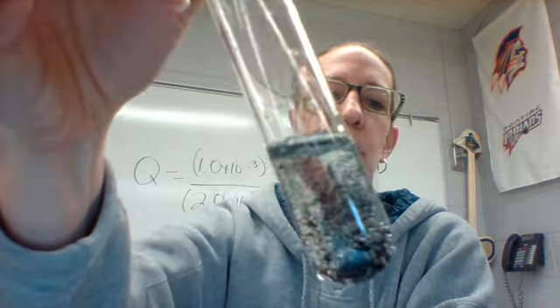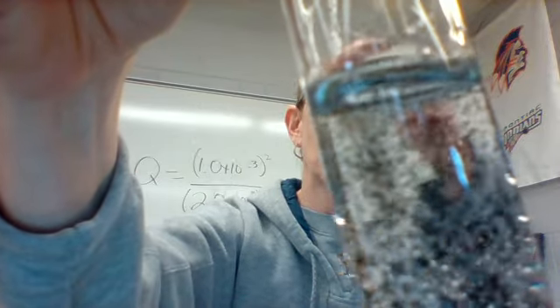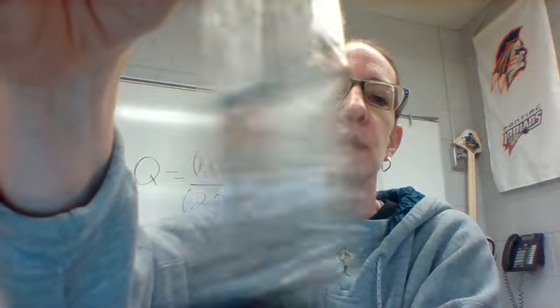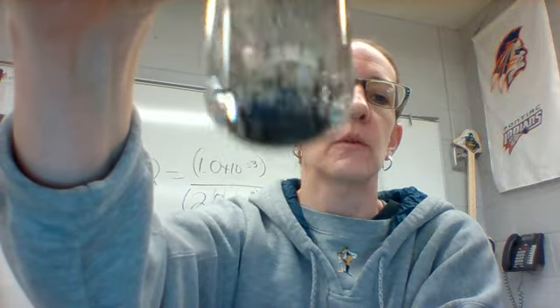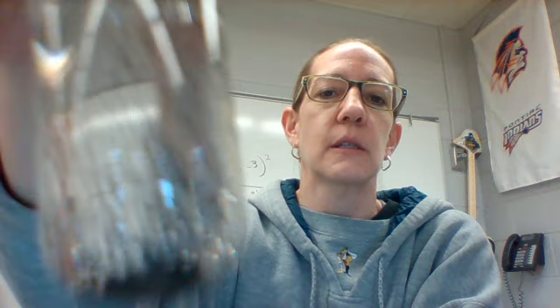I'm trying to get it to move around a little bit. Once I swirled it, you can see all those black pieces swirling around in that tube because that zinc has continued to break down. So that is the zinc and hydrochloric acid.